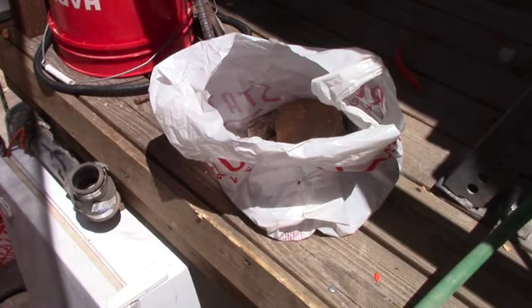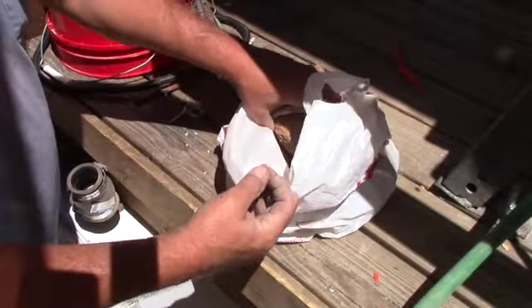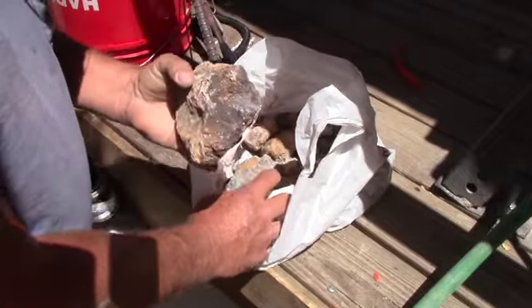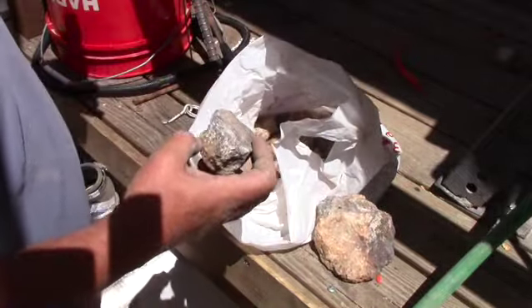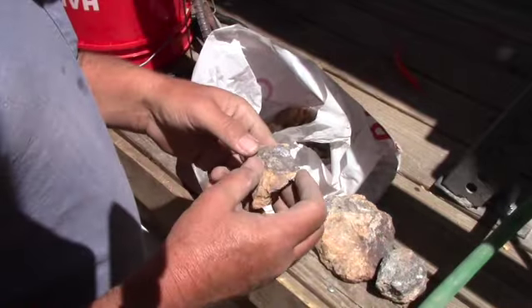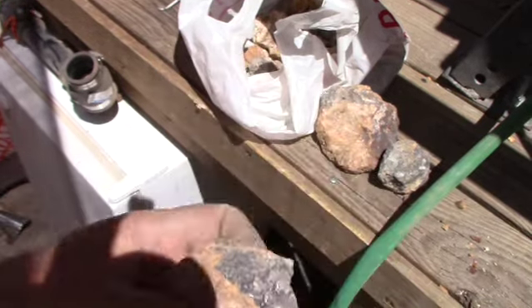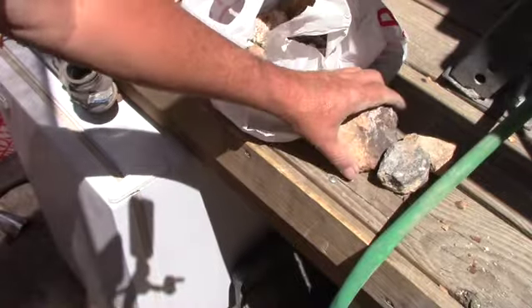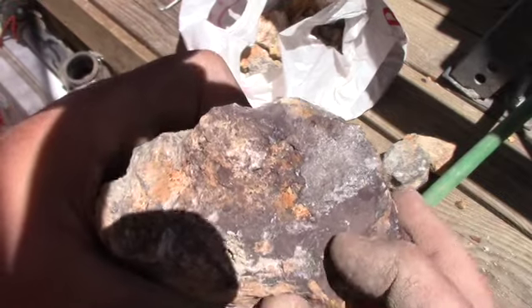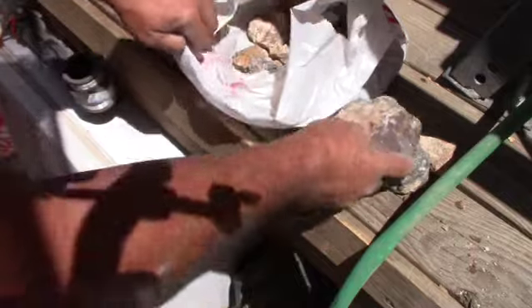Welcome back everybody. One of my fellow YouTubers, Xavier, gave me this bag of ore and supposedly it's galena. I've never processed silver from rock before — this will be a new experience for me and I'll take you through it step by step. We'll examine this and see what it looks like. Galena is a combination of lead and silver, so we'll have to separate those two; they kind of have an affinity for each other.